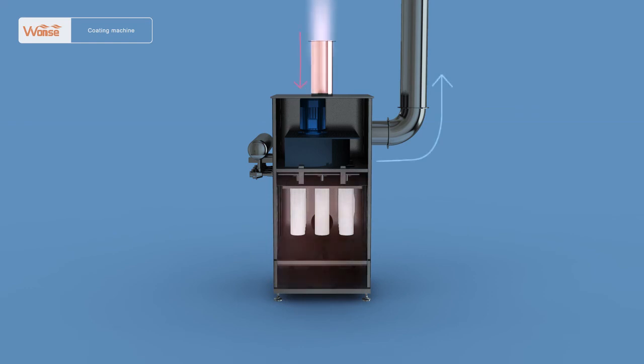Under the action of the explosion-proof centrifugal fan, the tail gas containing dust in the drum will enter the air exhaust cabinet through the air pipe that connects with the air exhaust cabinet, and will be discharged outdoors after going through the pulse backflush bag dust removal system, so as to meet the emission standard.